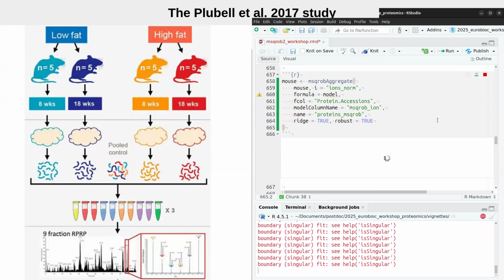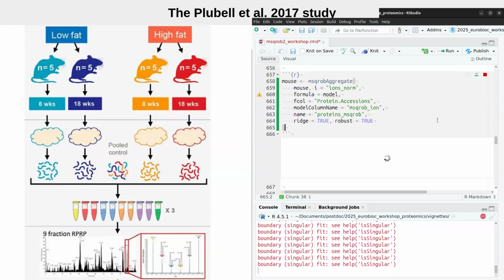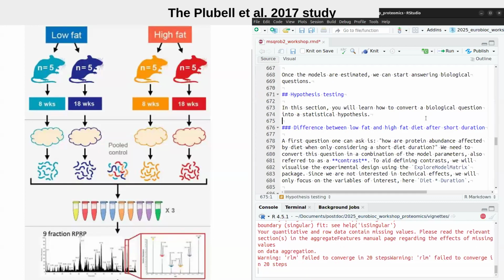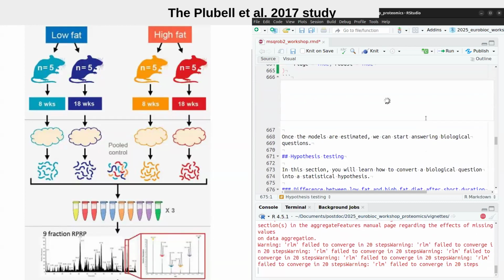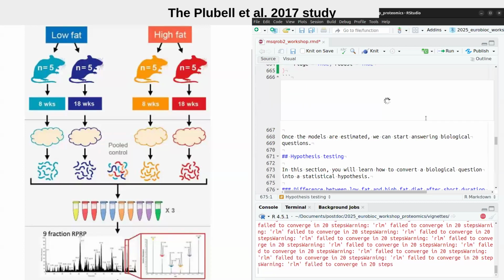But what we have seen is that it was rather difficult to disseminate to researchers, and that they often do not have protein expression values. And therefore we have two workflows, either starting at the peptide level, modeling peptide data right away and providing the protein expression from peptide level data, or summarizing first and doing it traditionally.